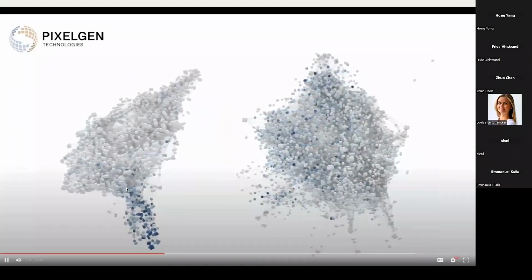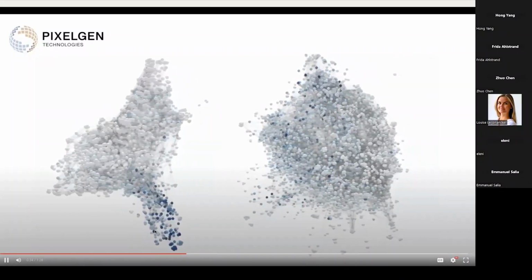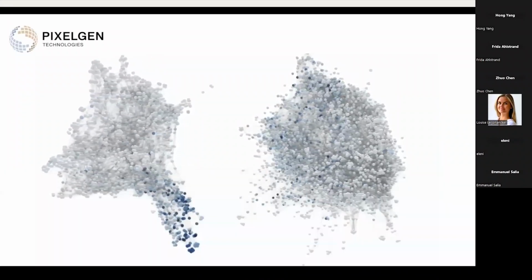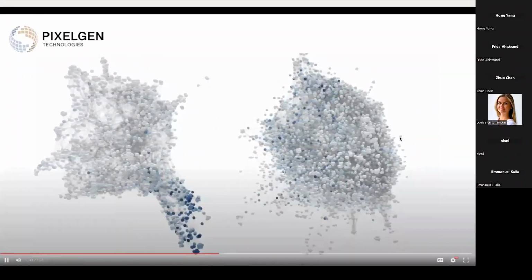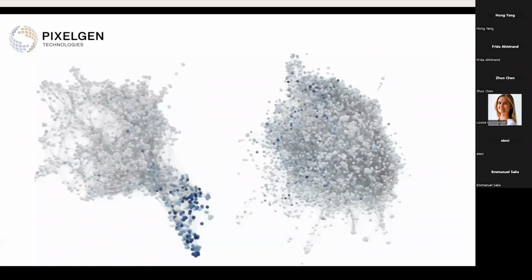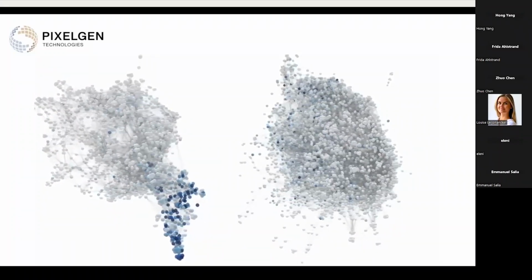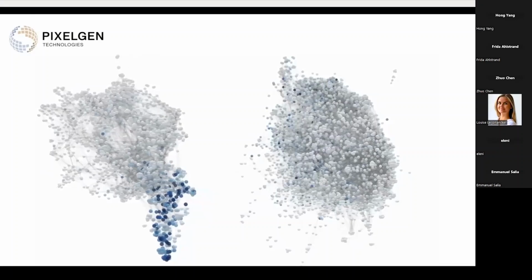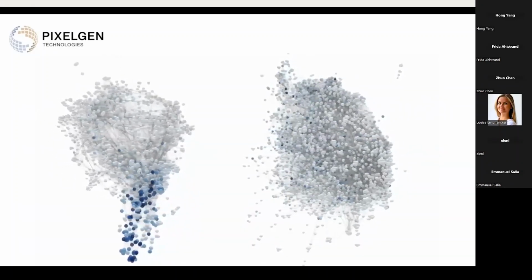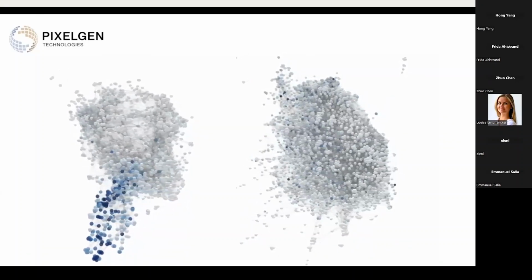And as you can see, they form this distinct partition or part of the cell that would represent the uropod. On the right, we have shown a non-stimulated cell from the control group. And as you can see, the same proteins have been highlighted there, and they're more or less uniformly distributed across the cell surface, not forming any significant patterns.